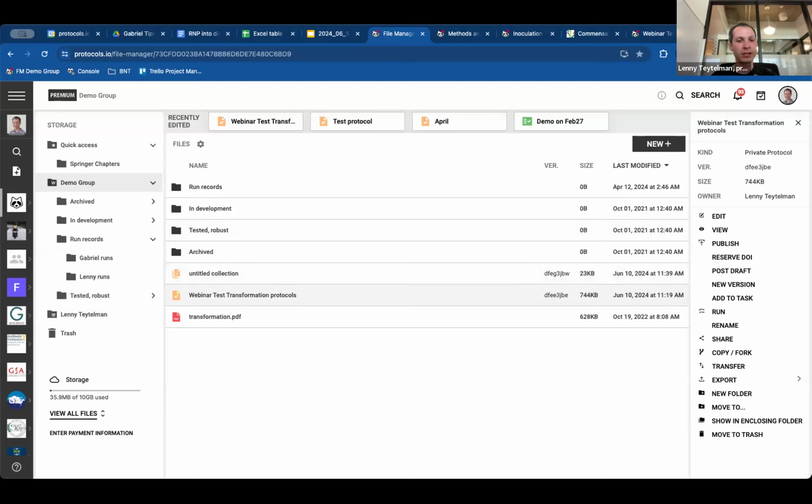I want to make sure that I can get to other people's questions as well. Yes, of course. But you might be right that if you're using the API, you might want a different workflow. So we might want to connect and look into that. Thank you very much. I'll make sure to be in touch if we ever get there, but basically I should look at runs rather than forks or copies. I think runs would work well, and you can get to them through the API. But I really appreciate your question and the time you took to listen to the webinar.